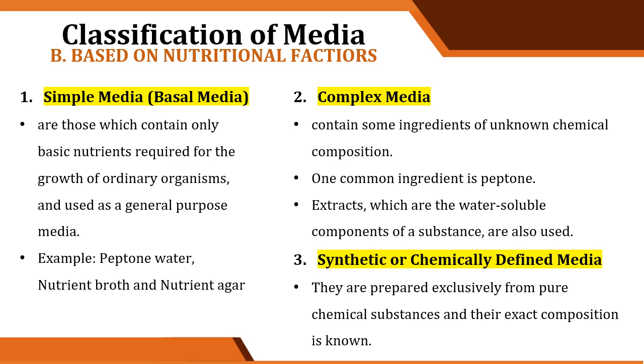Compared with synthetic or defined media, in defined media we know exactly what the chemical composition is. The individual components are weighed out exactly to make up the medium. That is the difference between complex and synthetic.